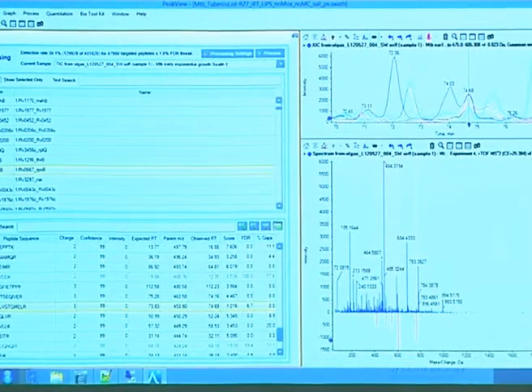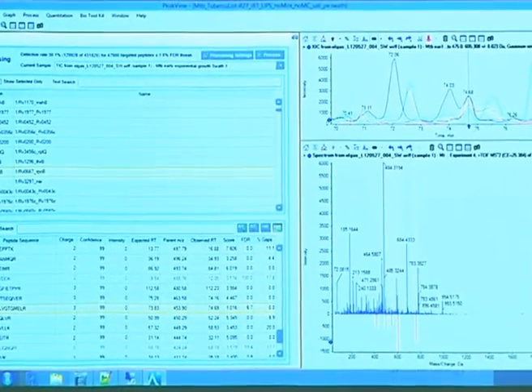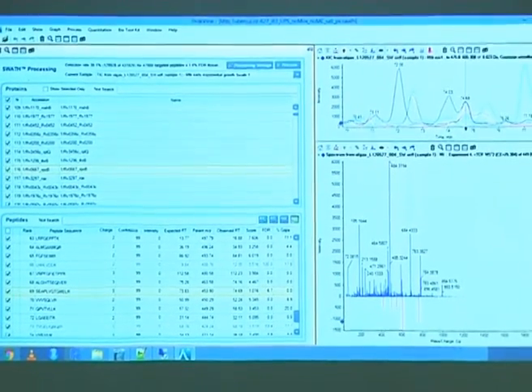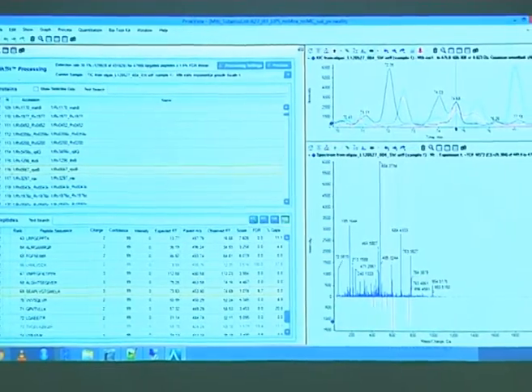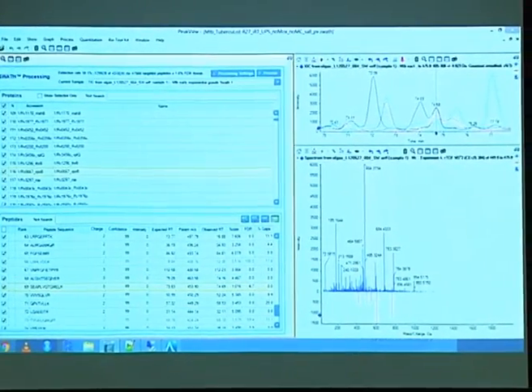Good. So you've done your analysis. The PeakView run finished, and then it basically just shows you like that. It doesn't do anything. What you can do now is, first of all, I would save the session.